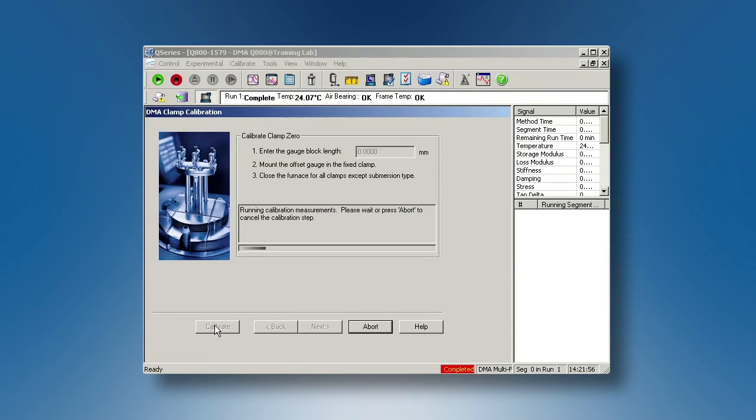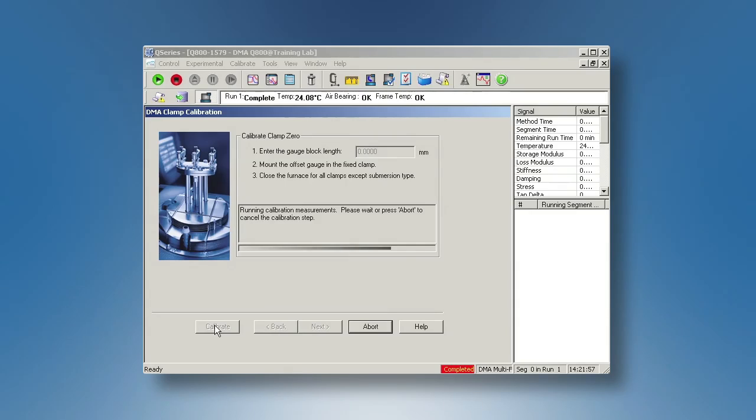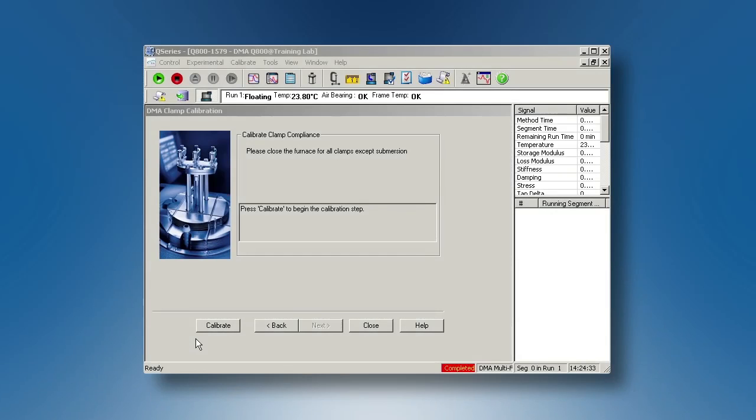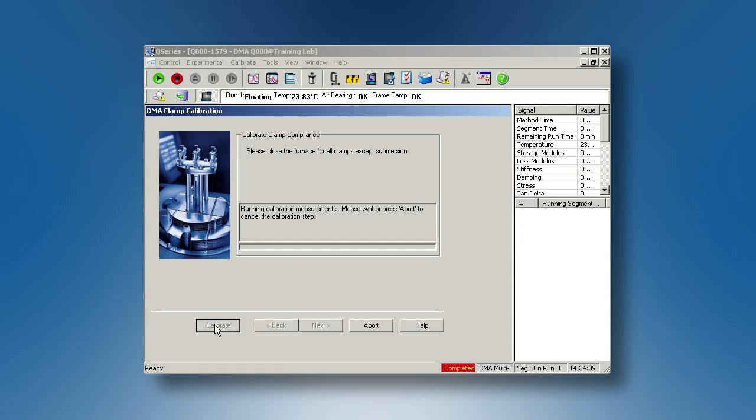For clamp compliance calibration, make sure there is nothing between the plates, then simply click on Calibrate.